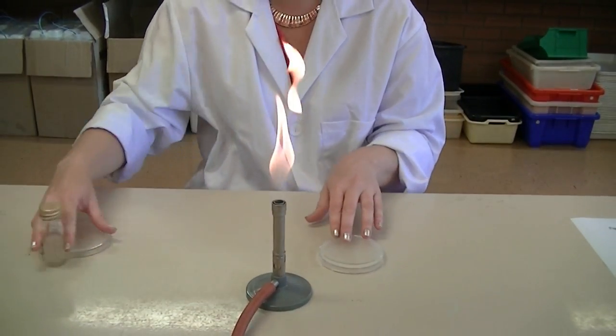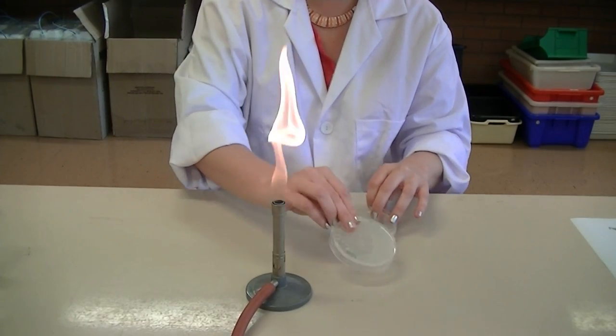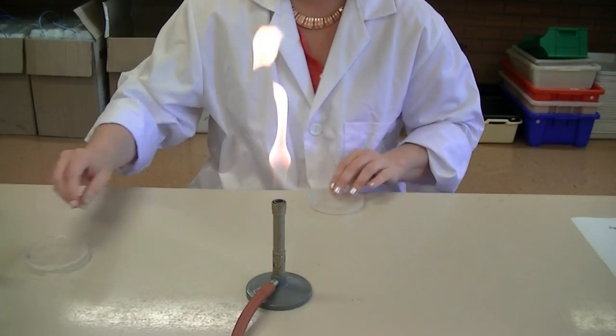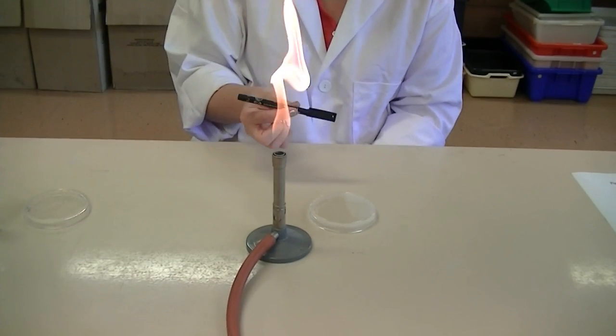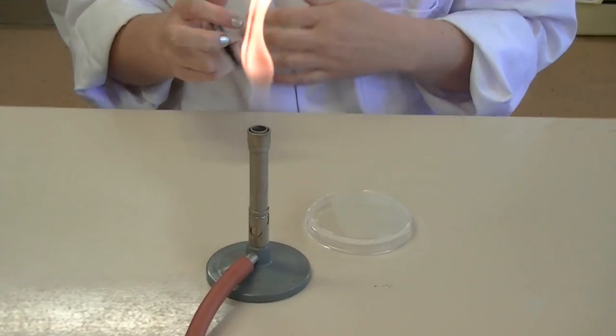In this example, I'm going to use nutrient agar and I'm transferring the organism E. coli. One of the first things you need to do when performing the streak plate technique is to actually label your plate. You should have a permanent marker on your bench and you need to label your plate with some key information.